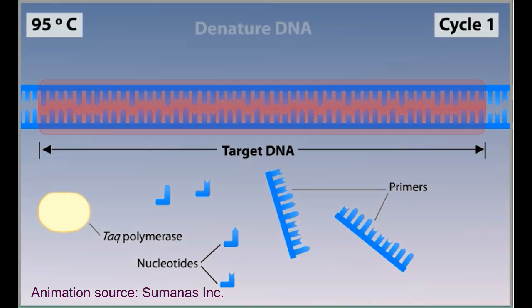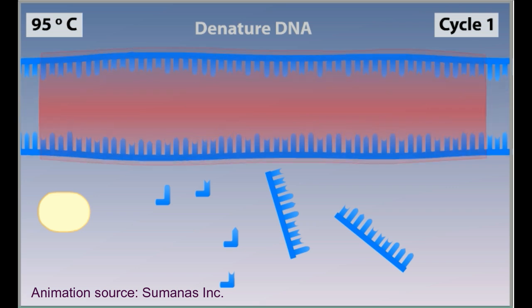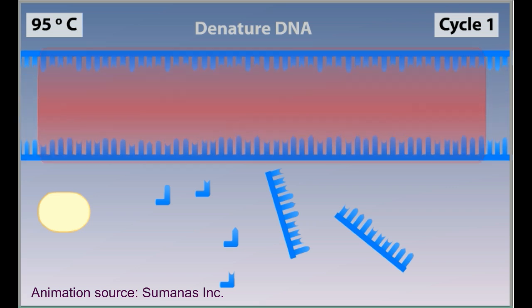A PCR reaction lasts several hours and typically consists of 20 to 30 repeating cycles. A cycle begins by heating the reaction mixture to 95 degrees Celsius. The heat denatures the DNA strands, breaking the hydrogen bonds that hold the strands together.